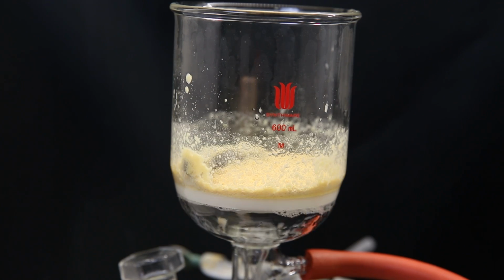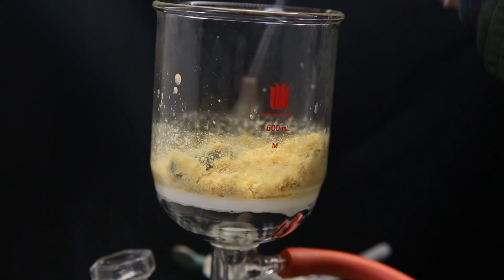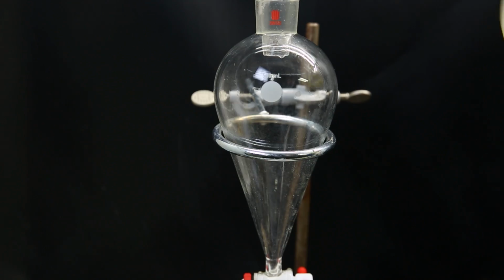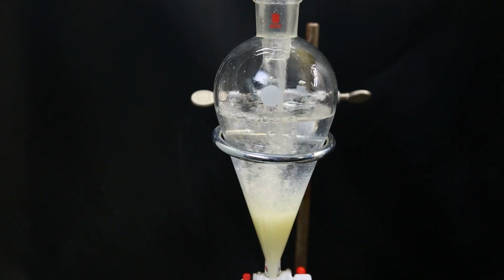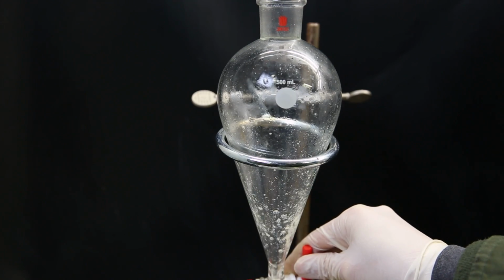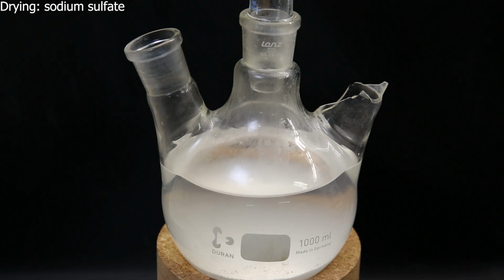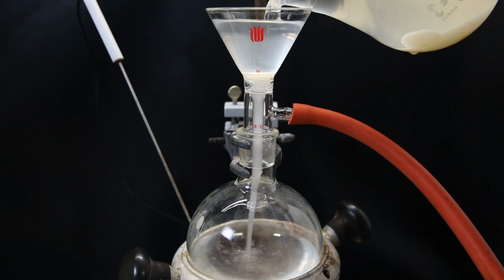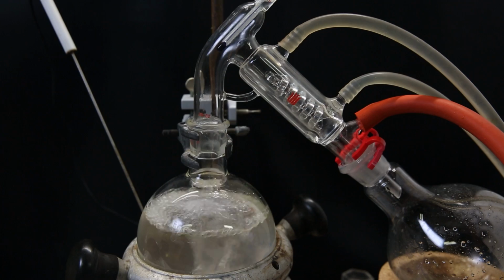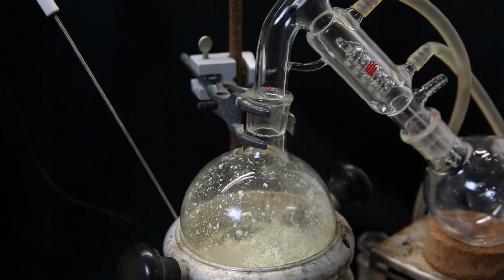I then wash the residue with 320 ml of heptane and discard the residue, which contains silica gel and some impurities. I then move the filtrate, which contains 2 layers, to a separatory funnel and separate the layers. I take the organic layer, which I have put into one of my broken flasks, and dry it with some sodium sulfate. I then filter the mixture to remove the sodium sulfate and distill over all of the solvent with short path vacuum distillation. When it has distilled to dryness, a white solid is left behind.